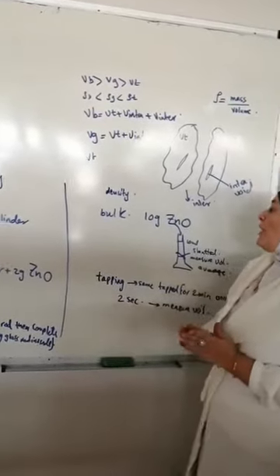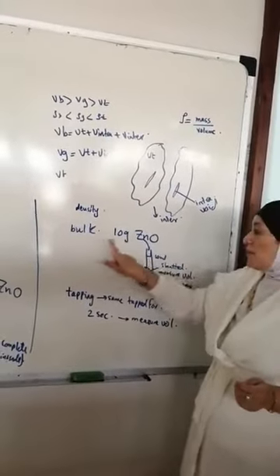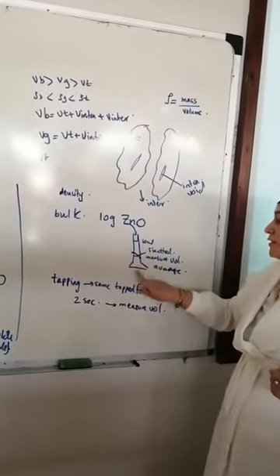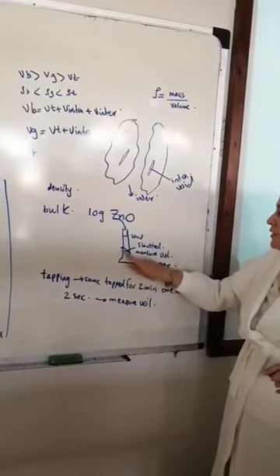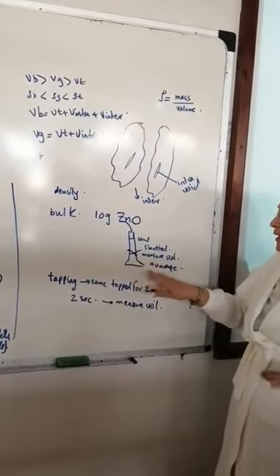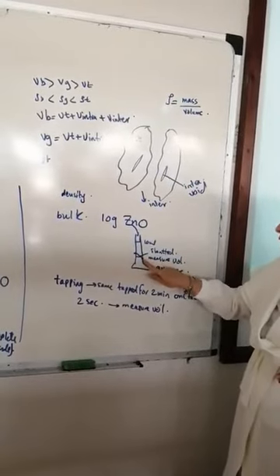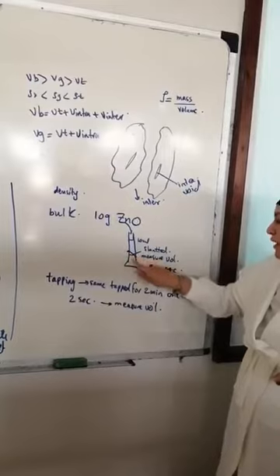So we start with measuring the bulk density of zinc oxide, using 10 grams of zinc oxide added to the cylinder, and read the volume. It may give a slanted surface, so we take the average of the high and low values.